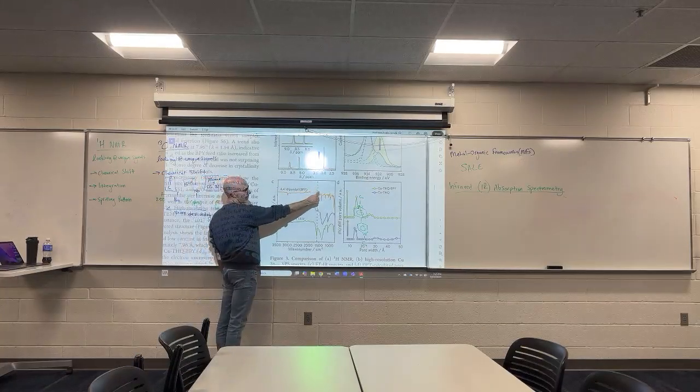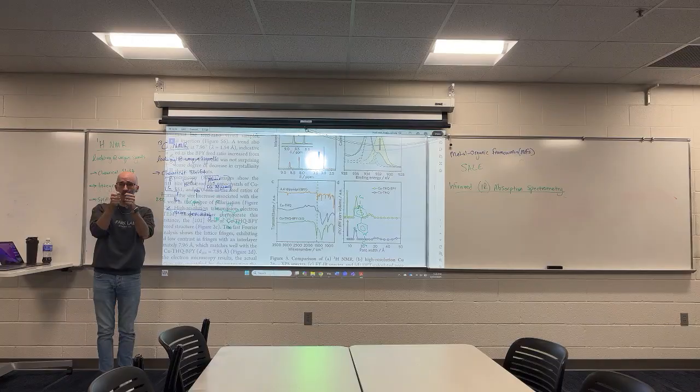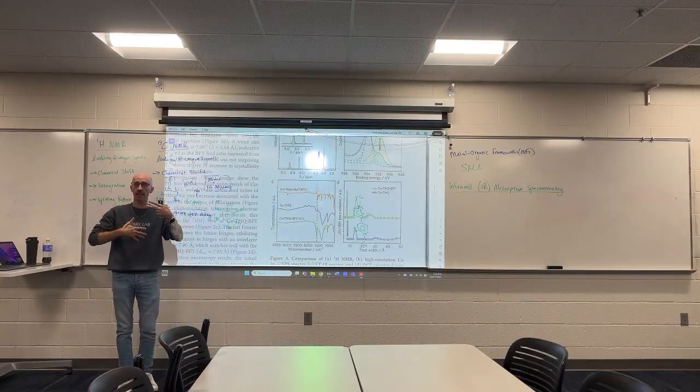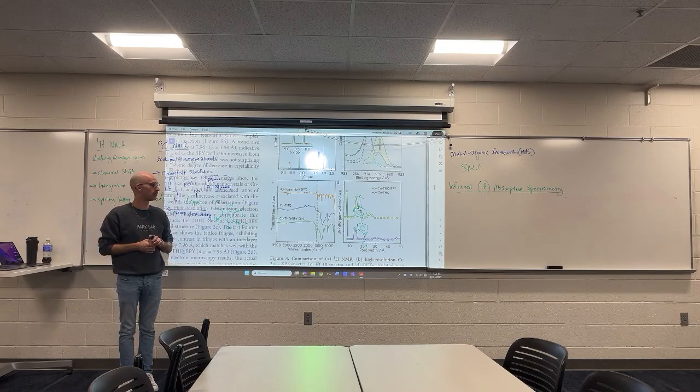In bipyridine alone, the signal for the CN bond shows up at a specific wave number. In order for that bond to stretch, it absorbs a specific frequency of light. But when I bind the nitrogen to copper, I change something about the carbon-nitrogen bond. I change nitrogen's behavior, which means I change how it behaves with the other things it's bonded to.